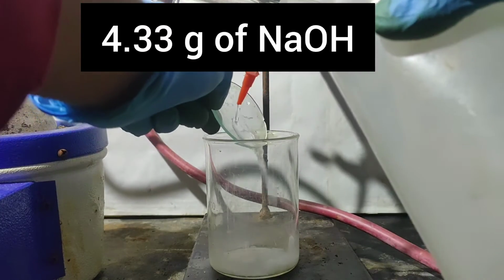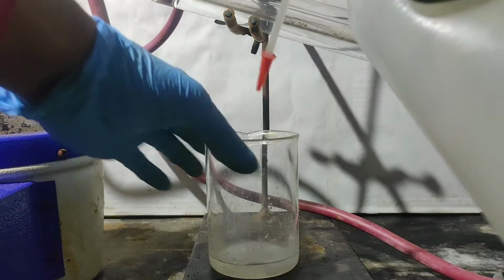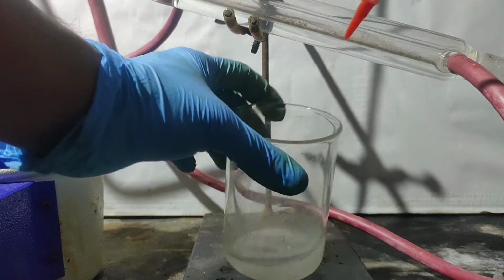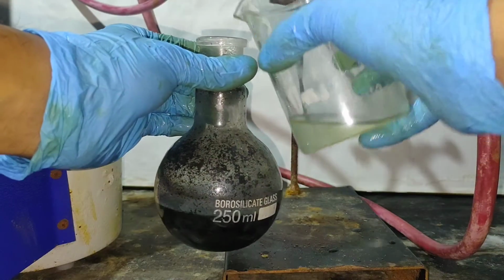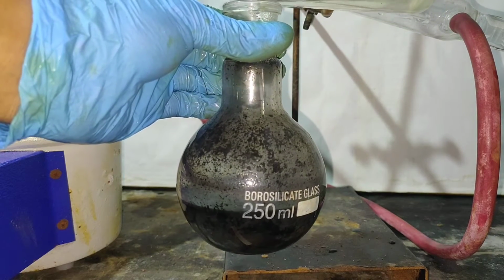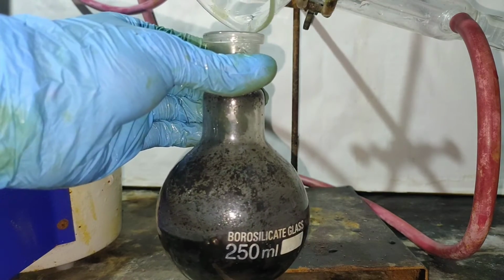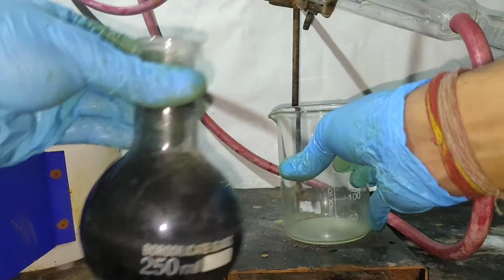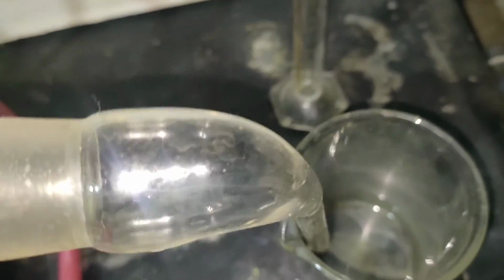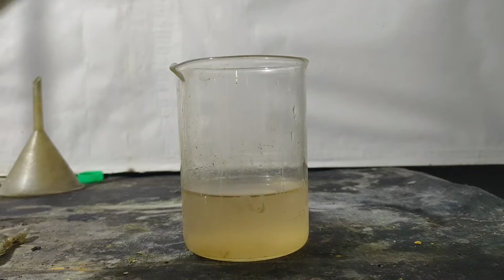Now I prepared sodium hydroxide solution by dissolving 4.33 grams of sodium hydroxide in 50 ml water. This solution was then added to the flask to freebase alpha naphthylamine. More water was also added and steam distilled. It looks like something is going into the distillate, as it looks cloudy. I collected 100 ml of distillate and added some table salt.